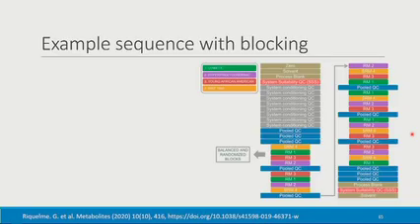Between the classes, I have pooled QCs, and when I get to the end, again, I run some more pooled QCs. I run a process blank. I run my system suitability QC to show that the system is still behaving and it's still under control, and one more solvent blank at the end.